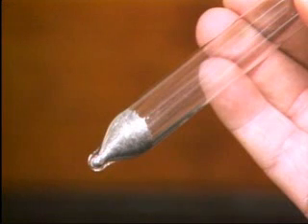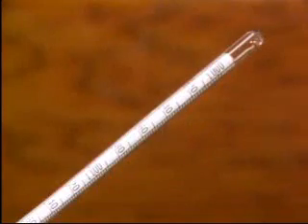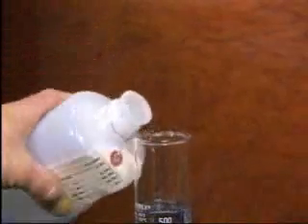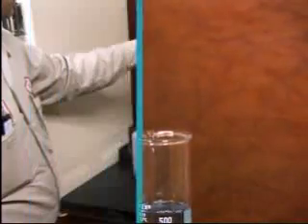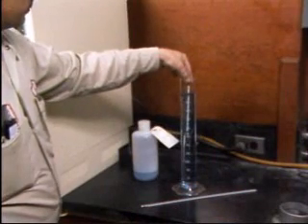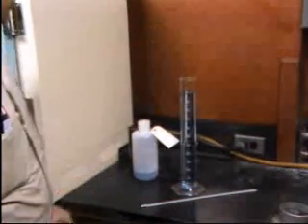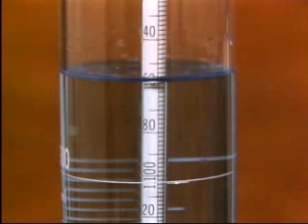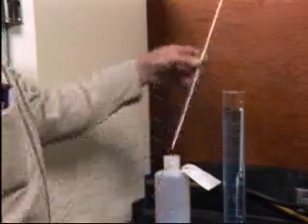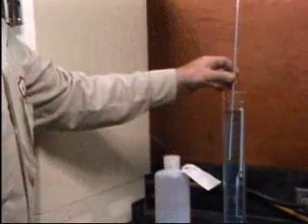A hydrometer basically consists of a float and a stem, which has a specific gravity scale. To run a specific gravity test, the sample is first poured into a container. Then the hydrometer is lowered into the container. The density of the sample determines how high the hydrometer will float. A hydrometer will float higher in denser liquids. The specific gravity indication on the hydrometer scale for this sample is 1.056.